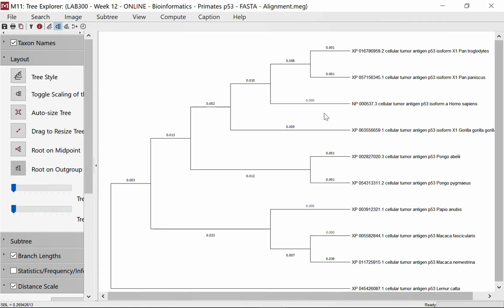Again, what I was pointing to you in the lecture is how using proteins ultimately has a big limitation in terms of defining events that have happened fairly recently in evolutionary times. Here we're talking about a few million years when Homo sapiens and Pan paniscus and Pan troglodytes have split. And you can see how with the protein analysis, there is a very hard time to define time. This is not really time, but it gives you a sense of distance, which is proportionate to time.